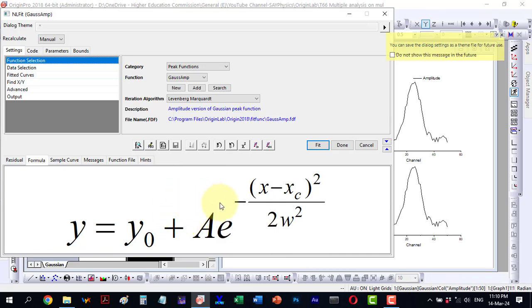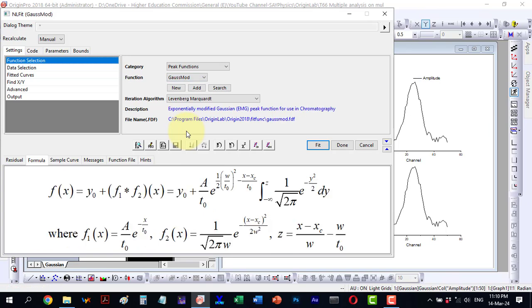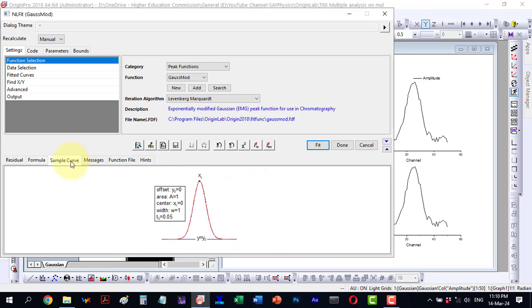Likewise, the GaussAmp function is straightforward. It is simply y equal y0, a very basic equation. However, the Gauss-Mod function is substantially different. Its equation differs and if we look at the sample curve, it appears like this. I will experiment with these using different functions. Let's begin.